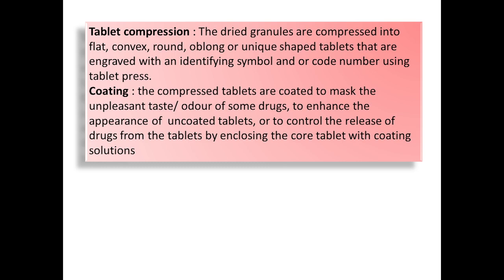So after that, compression is done, and most of the drugs are bitter in taste and unpleasant in odor, due to which coating is done after compression of tablet to mask unpleasant taste and odor of some drugs, to enhance the appearance of uncoated tablets, or to control the release of drug from the tablet by enclosing the core tablet with coating solution.